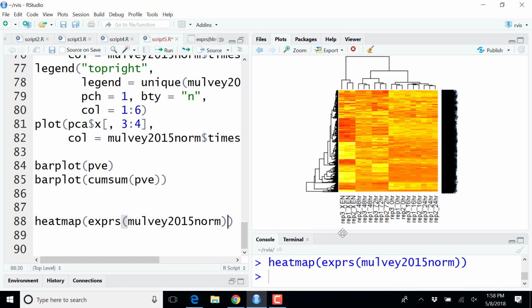There is also clustering that happens along the features. And here they are, we can't read them, there are too many of them. These clusterings will define how the columns and the rows are reordered. And then finally, the intensities here are replaced by colors.